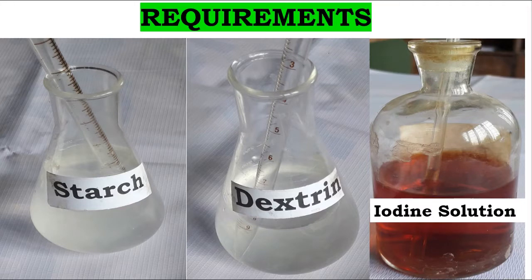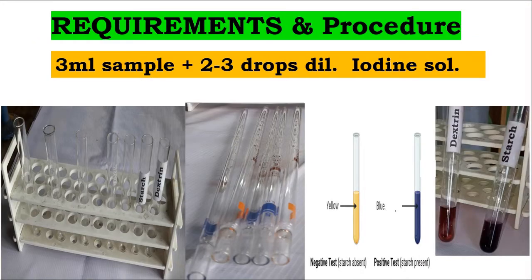The requirements for the test are starch, dextrin, and iodine solution, along with test tubes, a test tube stand, and a pipette. The procedure involves taking 3 ml of solution and adding 2 to 3 drops of dilute iodine solution.